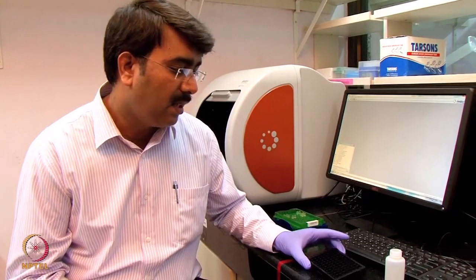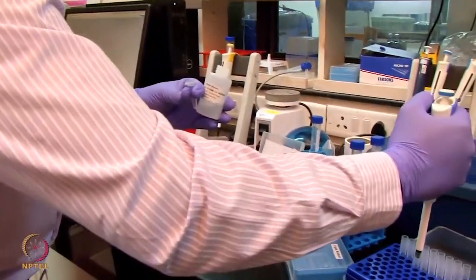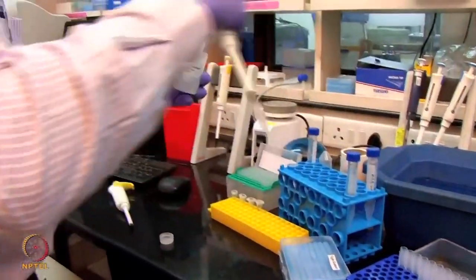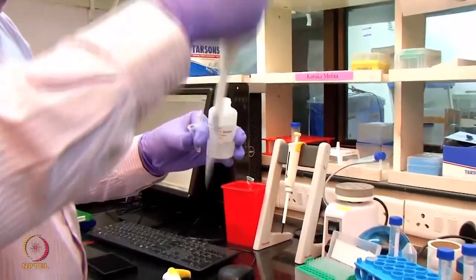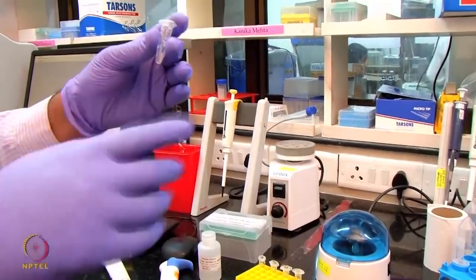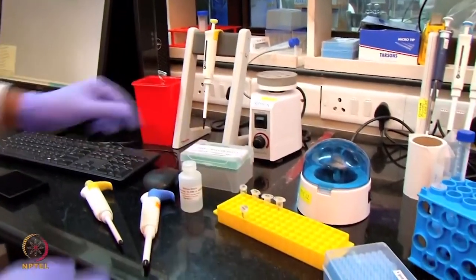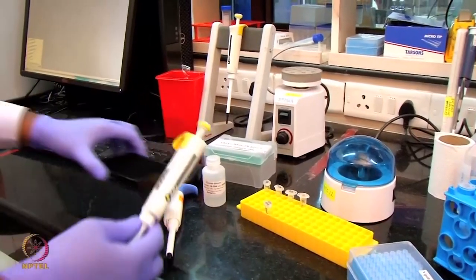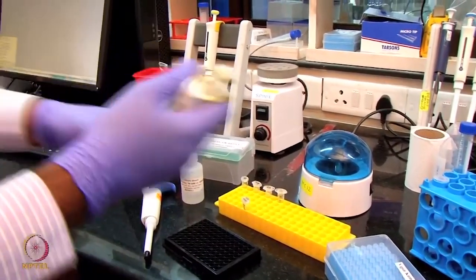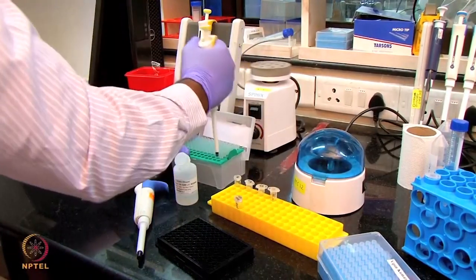It's pre-immobilized. So what I am going to do is make an apolipoprotein standard with a concentration of 50 microgram per ml. I have the apolipoprotein standard, and I'm going to dilute it to 50 microgram per ml using the sample diluent. From this I'm going to do a serial dilution, a two-fold dilution with the buffer. Prior to that, I'm taking this 96 well plate and adding the buffer into the wells.